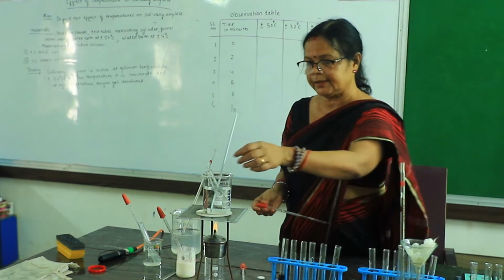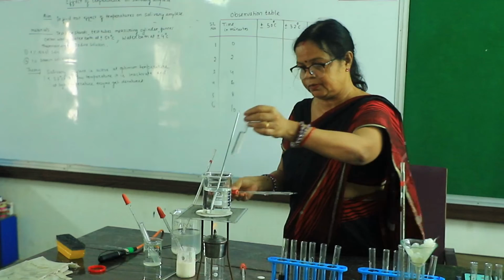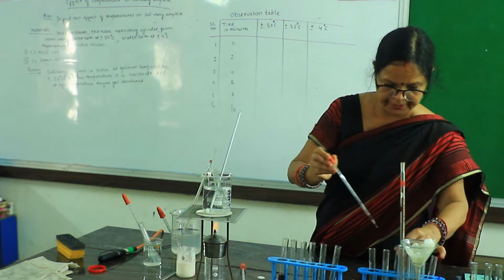So after 2 minutes, again from this test tube that remains in the water bath at 50 degrees centigrade, add to the third test tube.